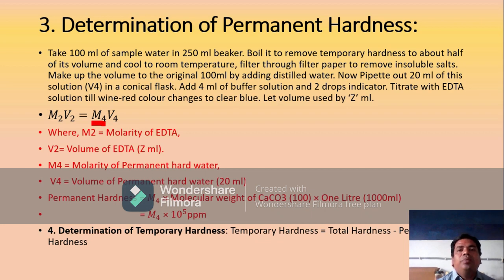So this is the determination of permanent hardness, and the total experiment is determination of total hardness of water sample by using EDTA method or complexometric method.